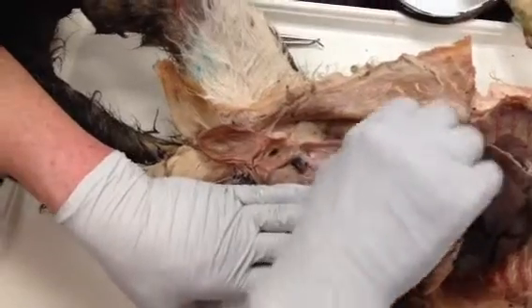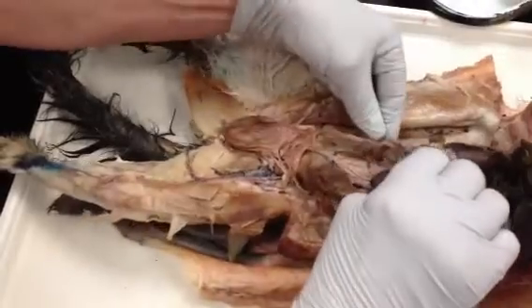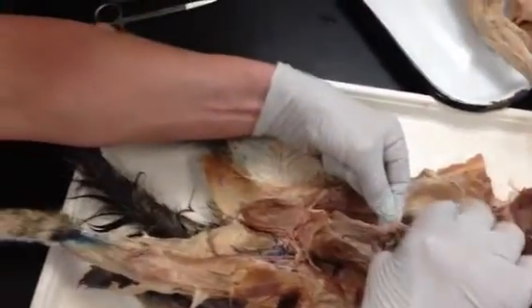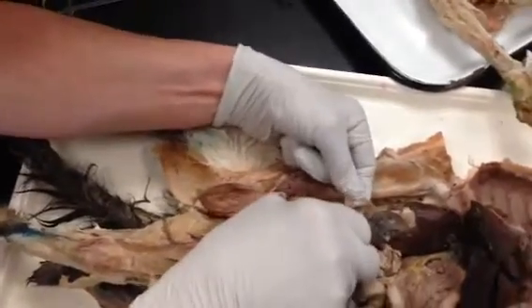The head is going to be the ovary, and the tail is going to be the oviduct. What is the whole thing here? Okay, let's do that again.